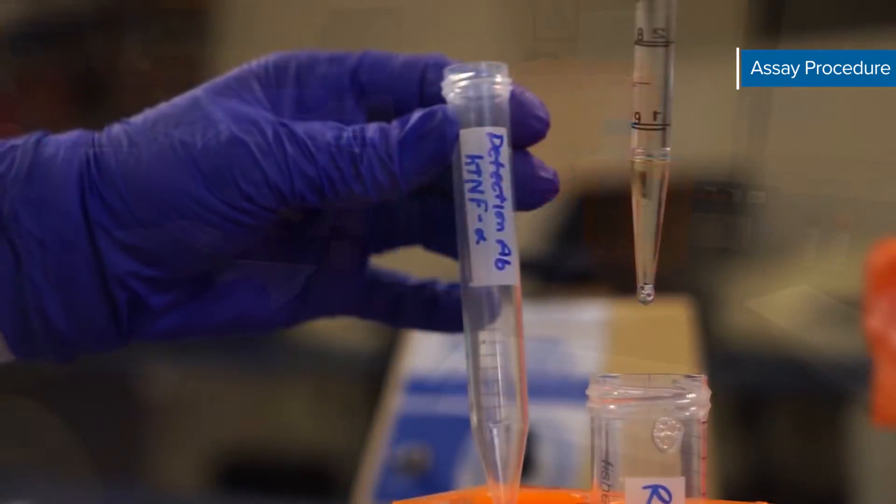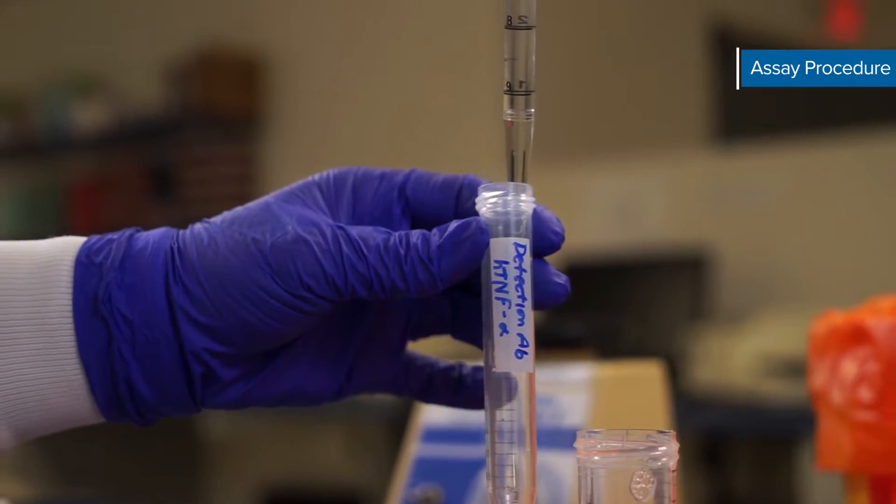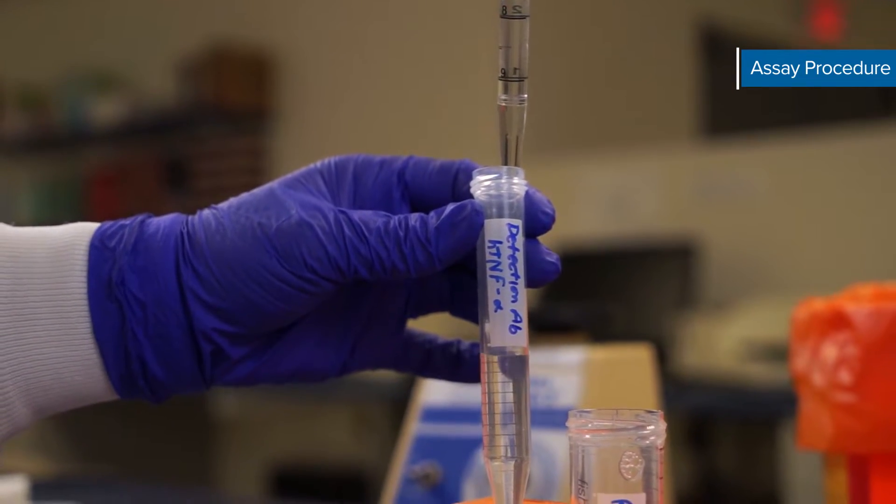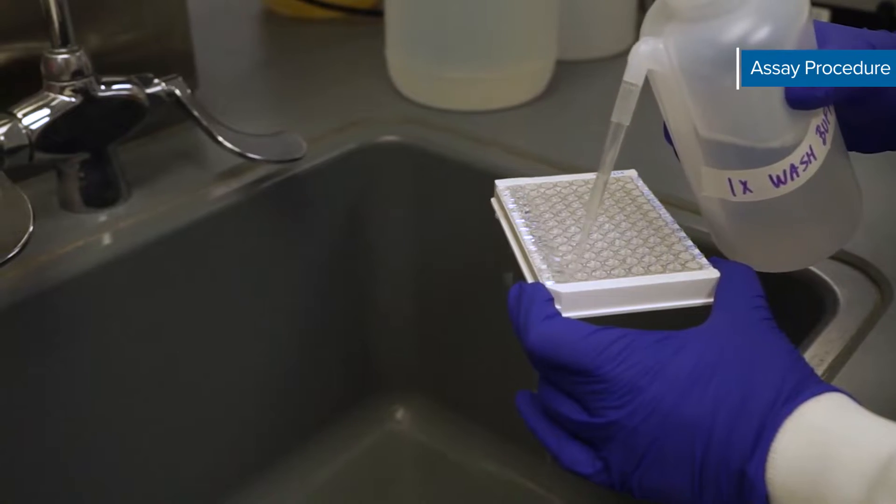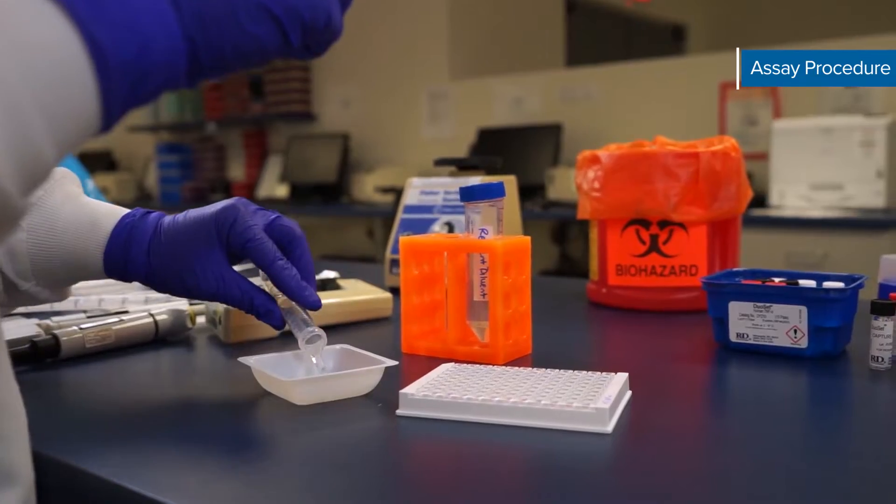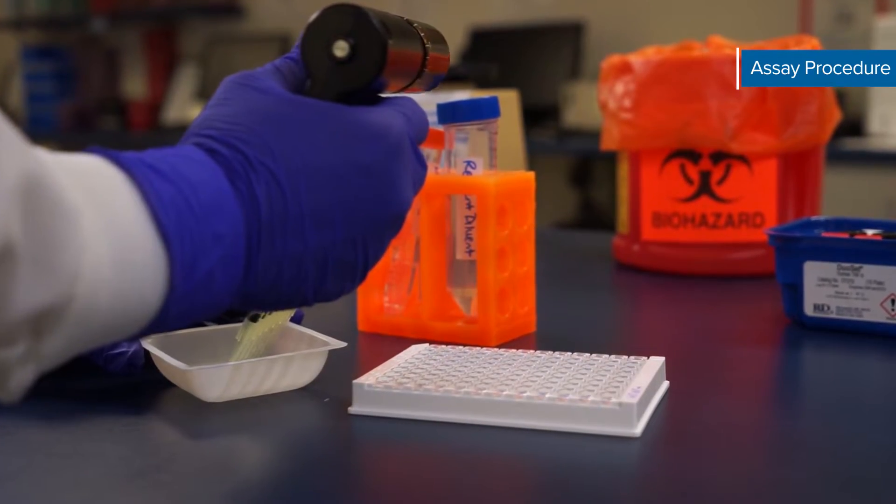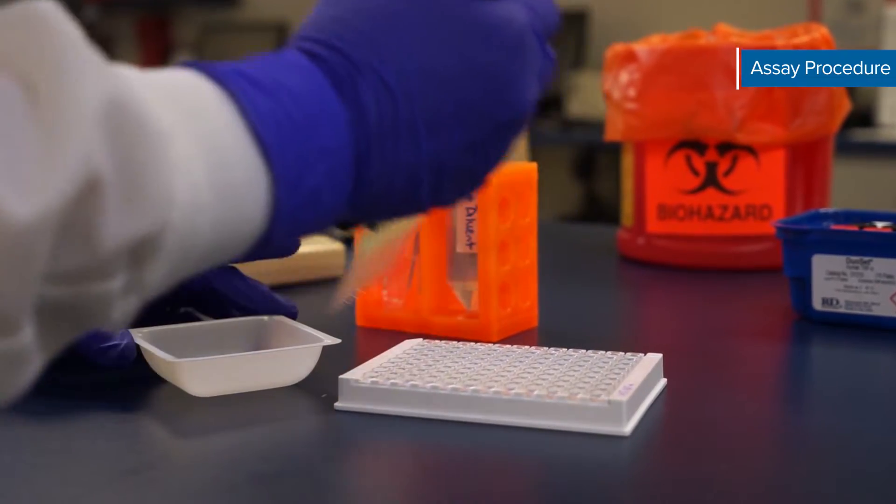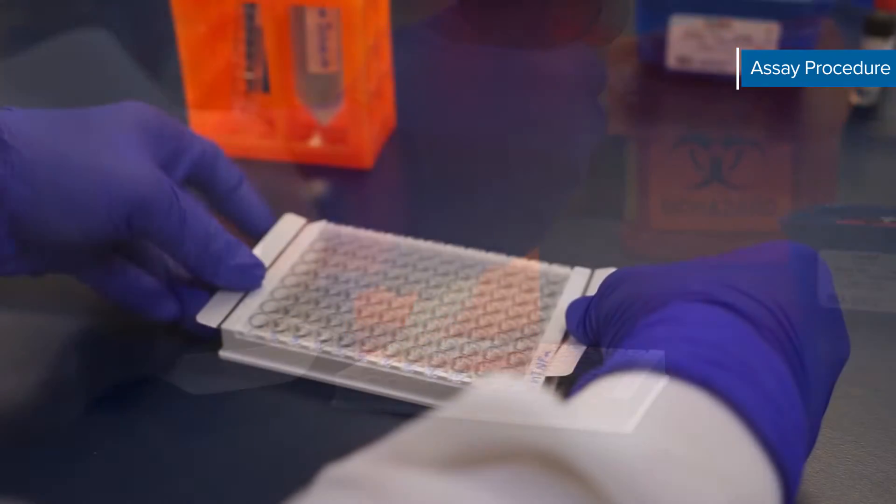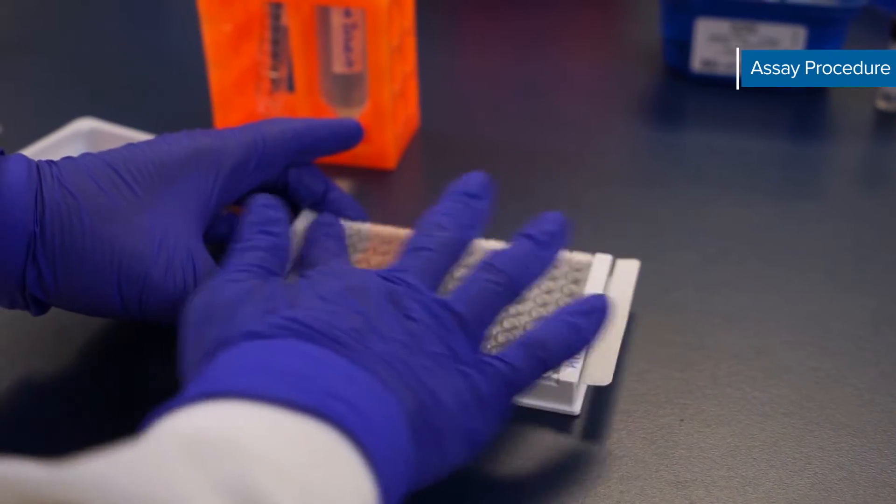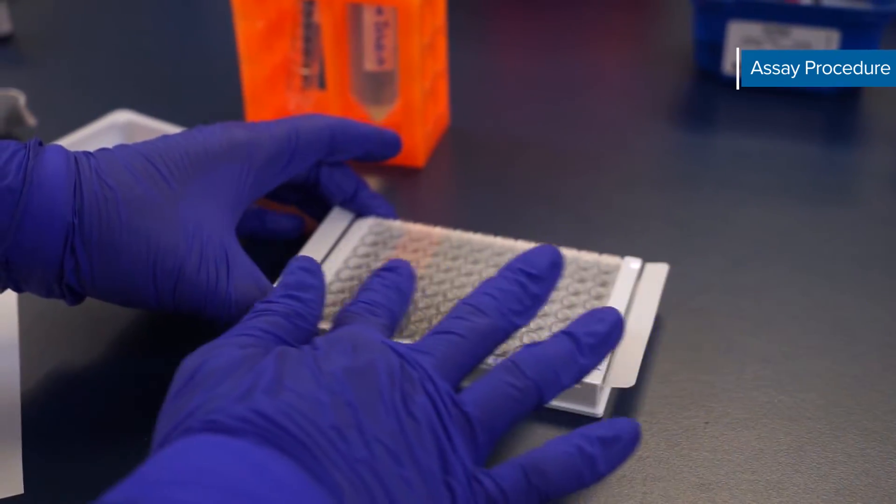During this sample incubation dilute the biotinylated detection antibody to the working concentration. Next wash the plate just as you did in the plate preparation section. Next add 100 microliters of the diluted biotinylated detection antibody to each well. Cover with a new adhesive strip and incubate for two hours at room temperature on the benchtop.